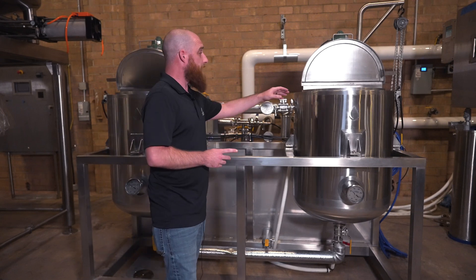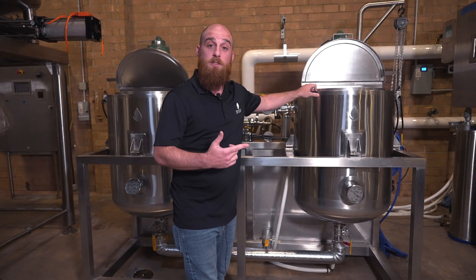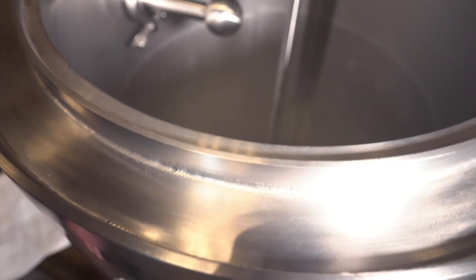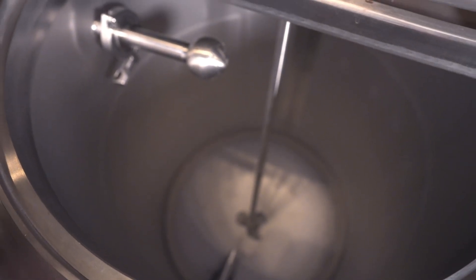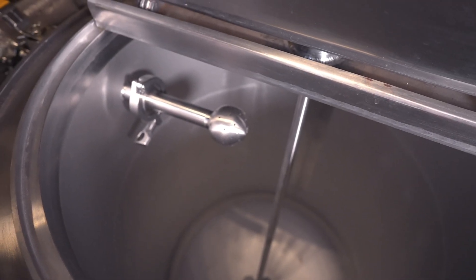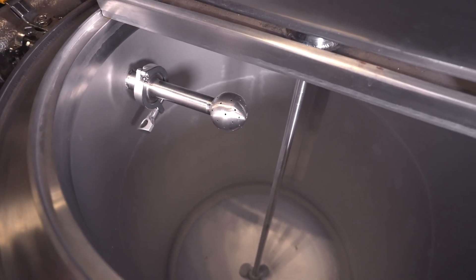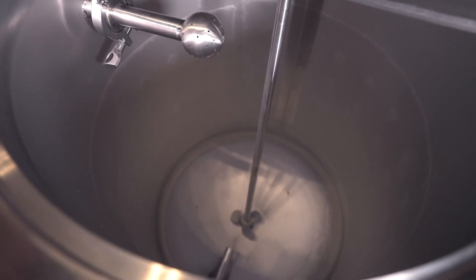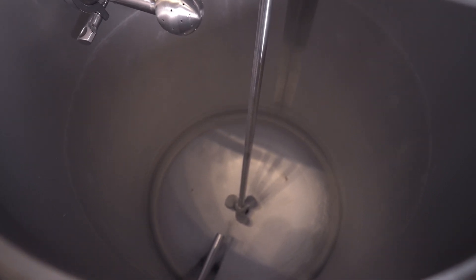From there, we'll also be able to take a look inside to see our recirculation points as well as the impellers to make sure that everything is agitated and suspended in that mixture. Here we see the inside of the tank and the first thing you'll see in the center is our paddle impeller that's going to help introduce the ethanol into our crude oil extract. On the top left, we see our clean-in-place rotary spray ball, which will be able to spin 360 degrees to ensure proper cleaning at the end of the process. Down at the bottom on the left-hand side, you'll see our temperature probe, and then finally the exit port.